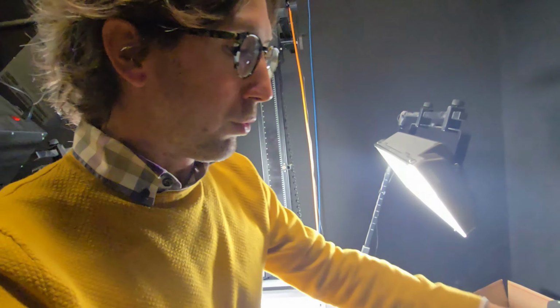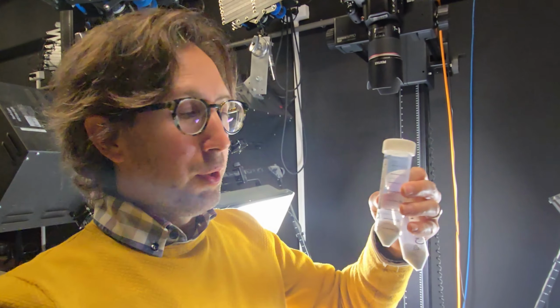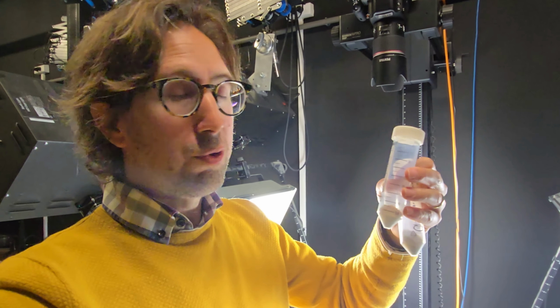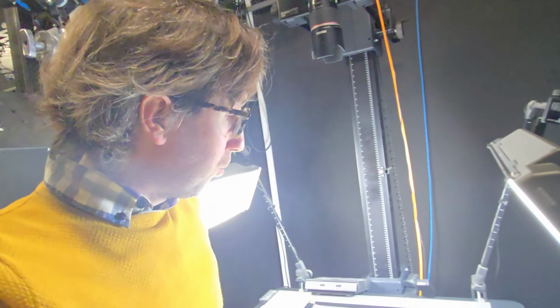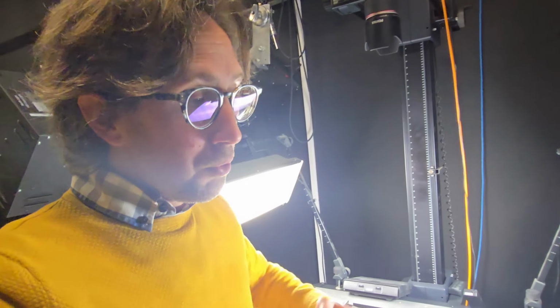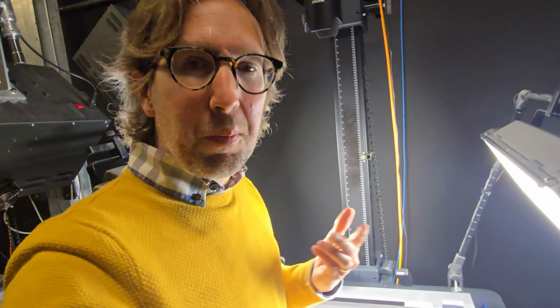So we're kind of going through different cycles with a ball mill to see how we can get the most uniform fine grind, to then do the ICP-OES, ICP-MS, or even isotope analysis with those green coffee beans. So to know how the progress was going with grinding it and how uniform and fine, I wanted to already get some kind of measurement.